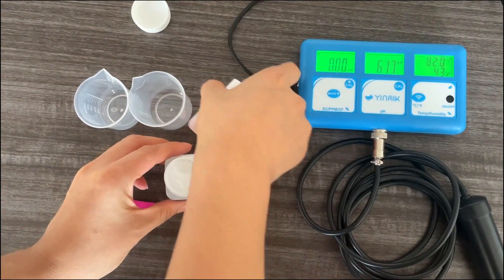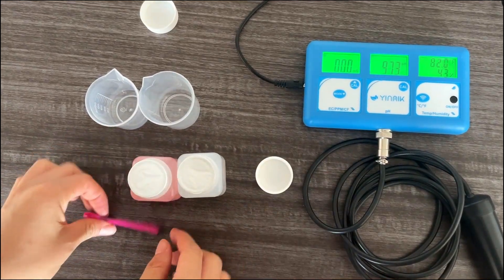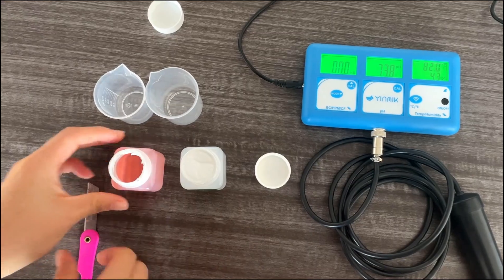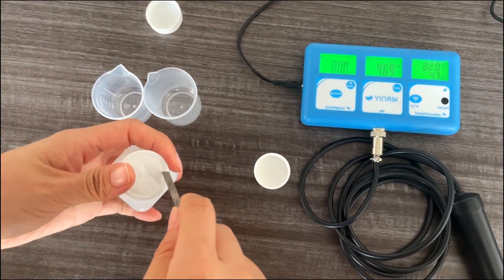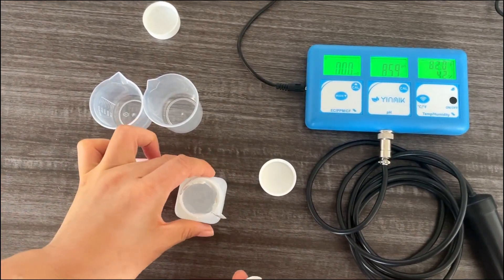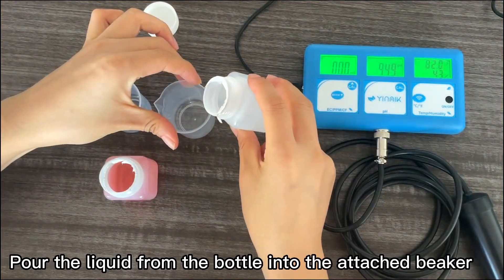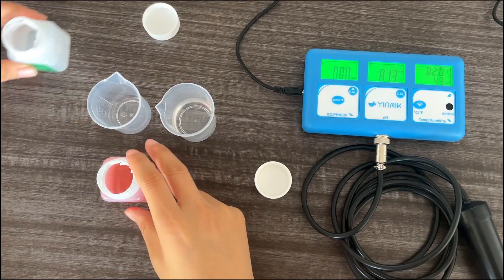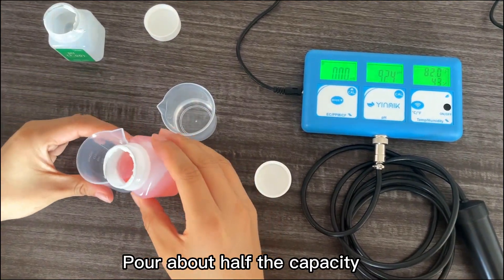Open the cap. Open the sealing strip with a knife. Pour the liquid from the bottle into the attached beaker — about half the capacity.